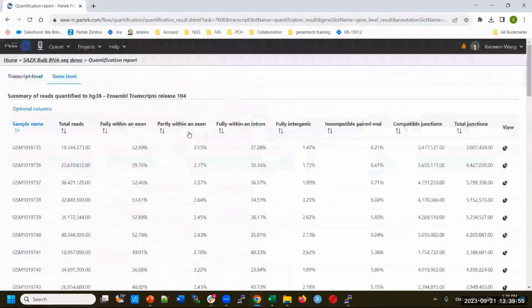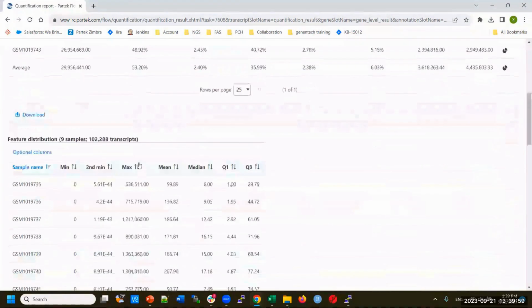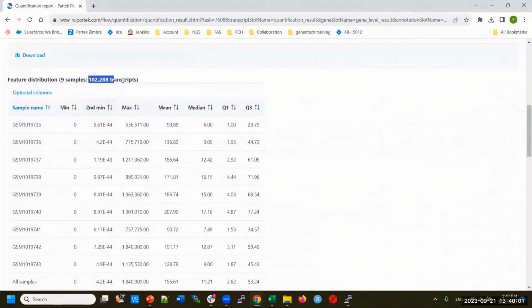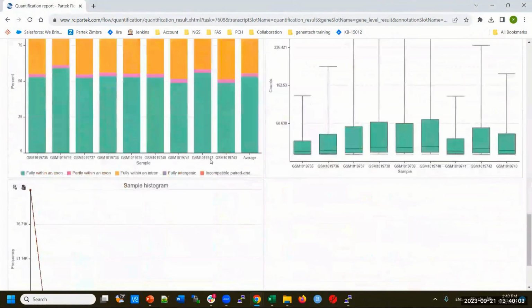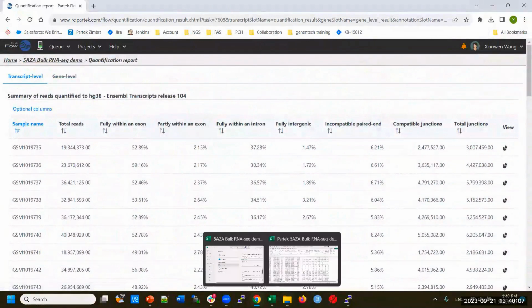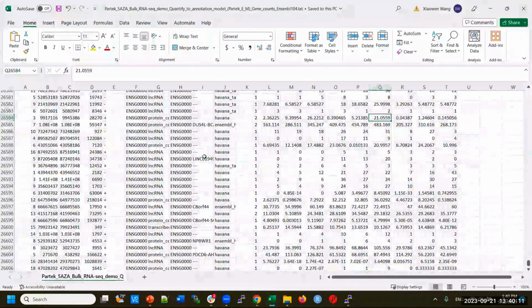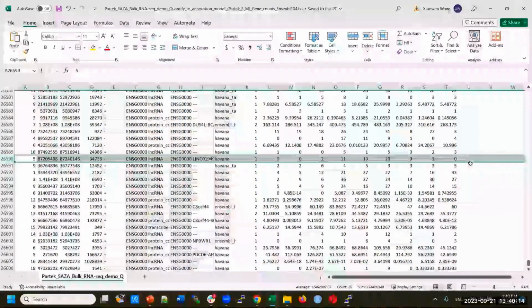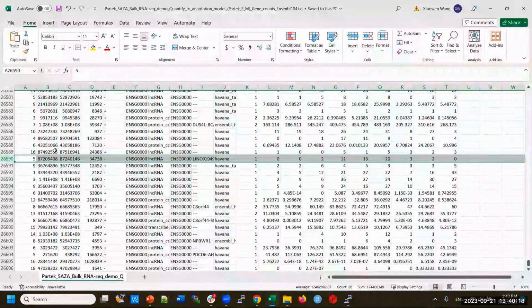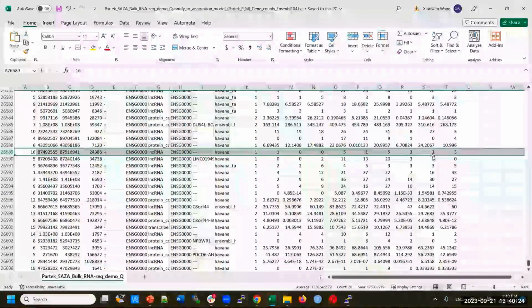Okay, so this is a gene level, and this is a transcript level page. It's a similar format, but you just have more transcripts here. Okay. You know, at this stage, if you look at this table, you will notice that there are genes. So even we filter out the total count. If the sum is less than 10, they already filtered it out. But some genes, you know, the total is greater than 10. But if you look at each sample, they're very low, right?